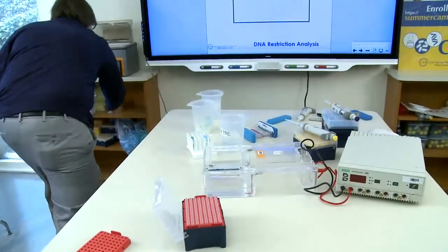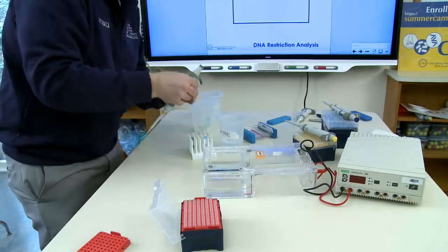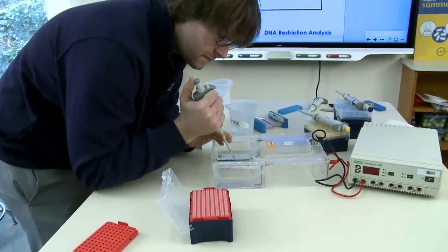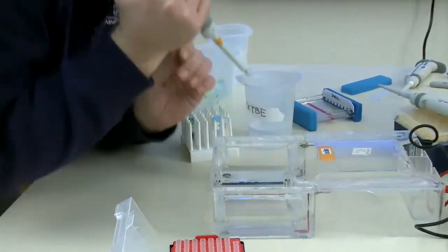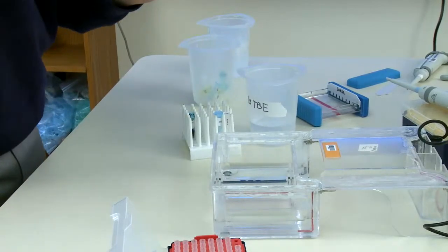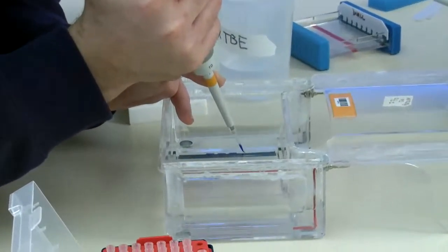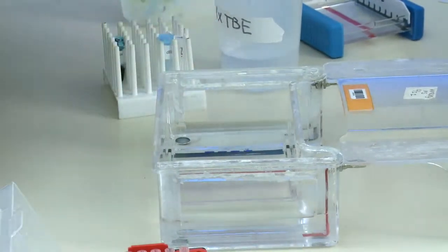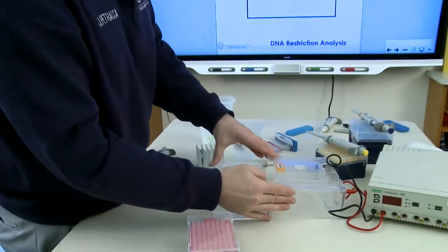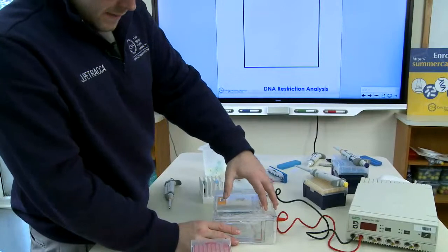All right, so I'm going to go ahead and load my last 2 samples now. So here's my minus tube. And last but not least, here is my question mark tube. Okay. All right, we're all done. So we have our samples loaded nicely in there, 4 little rectangles, and they look pretty good.